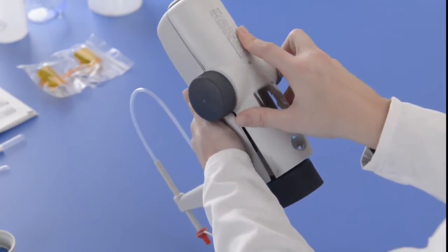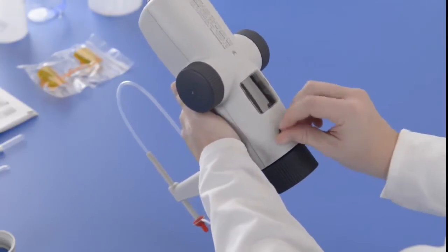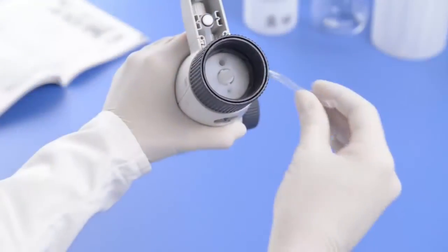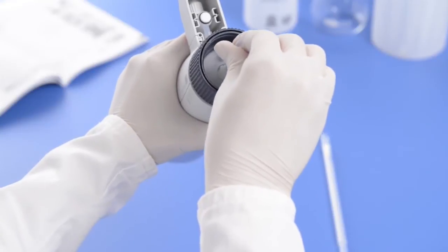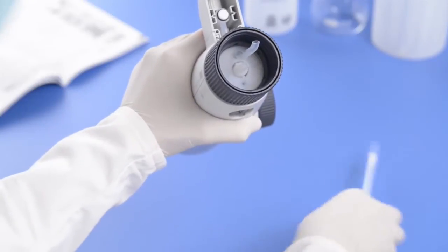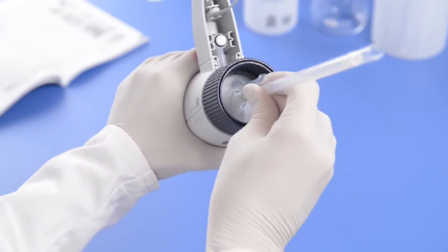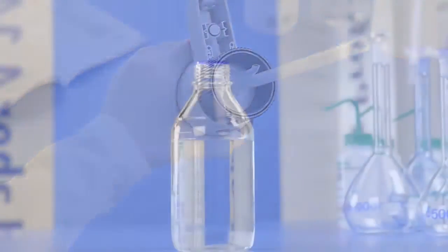Screw the air vent cap back on. Now the recirculation tube and the filling tube can be mounted and adjusted.